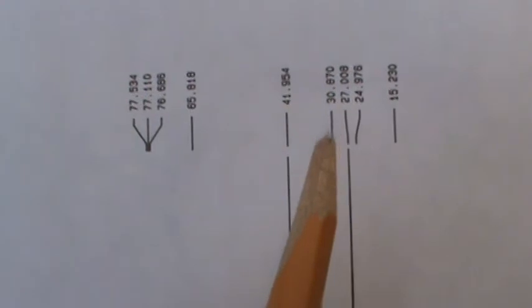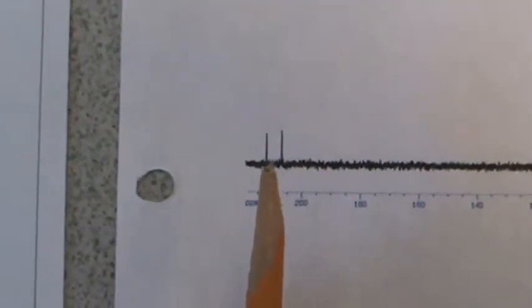2 of them are diethyl ether. 1 of them is acetone. I'm willing to bet acetone is probably the 30 peak. You could easily confirm that using SDBS. If that is acetone, there has to be another carbonyl peak, and sure enough, there is. Our product, cyclohexanone, is 209.